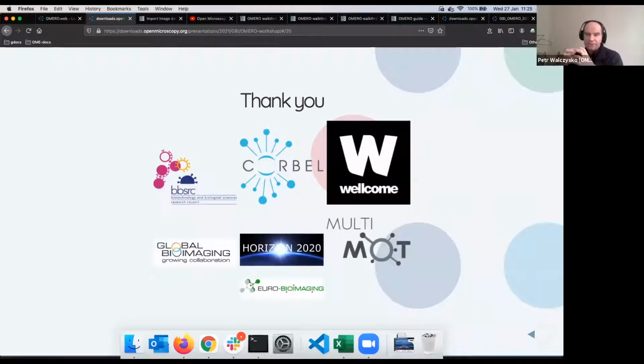How much space is allocated to a user is completely up to you. What do you mean by you in this case? You, I mean your institution, mainly. So the idea here is that Omero server is a software, okay? And that's what you get for free. But every software needs some hardware to run on. The hardware is not what you get for free. The hardware is something you have to provide on your side, download that free software onto that hardware and run it.